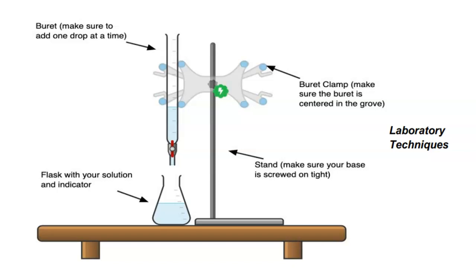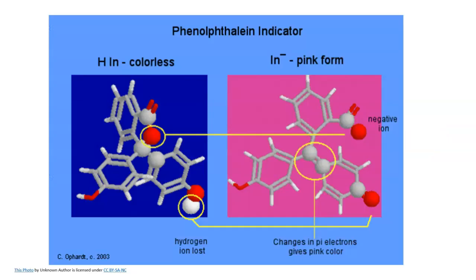So you're going to measure some solution and put it into your flask before you start to titrate until the reaction between the two is complete. Okay, so you will see when it is complete. I don't think you should worry about that at all.